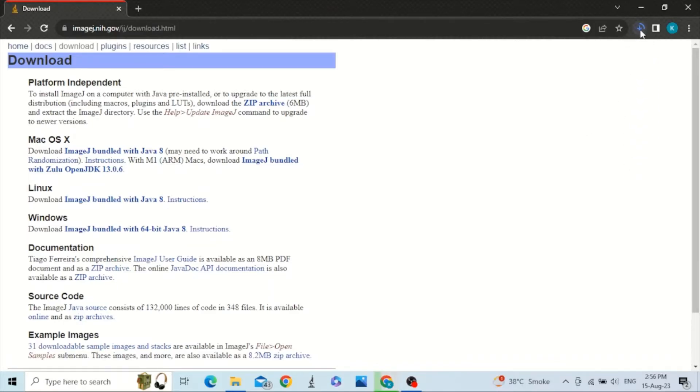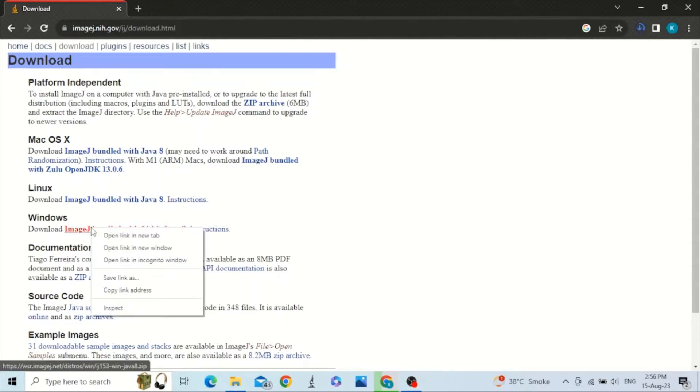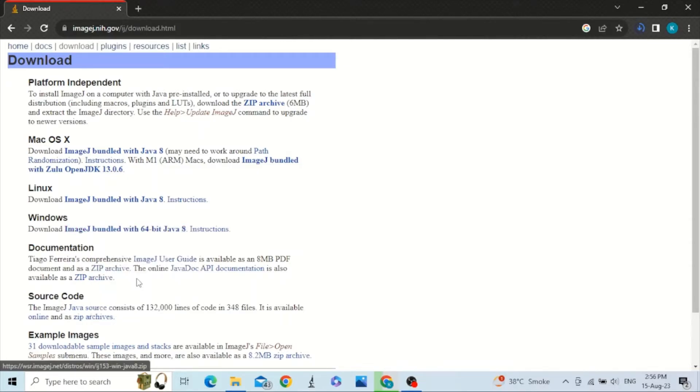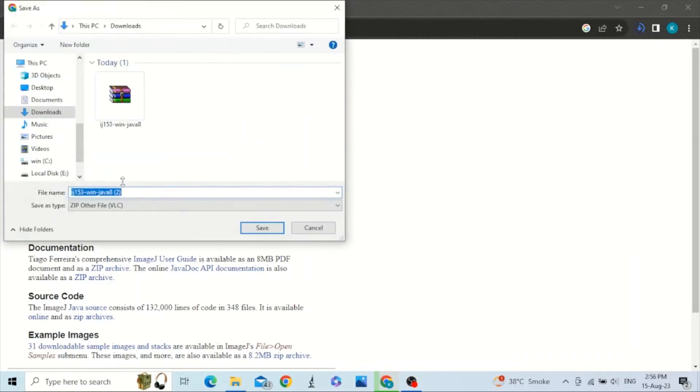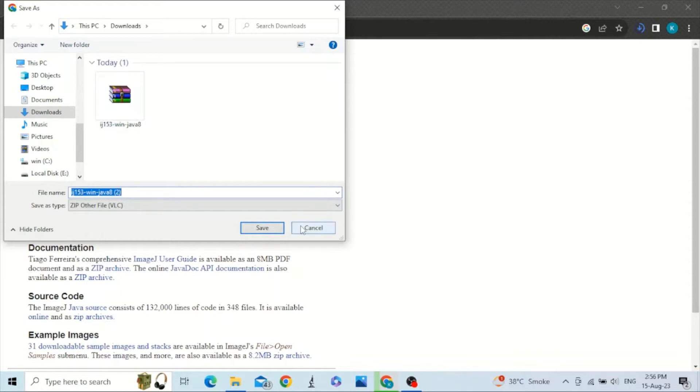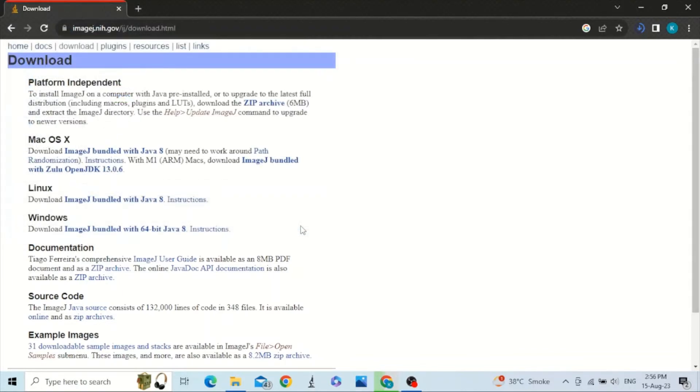Download has started here. Another way to download is just to right-click it and save link as. It will ask you a path. You may give it a path. I have already downloaded, let's see what we will do with this.